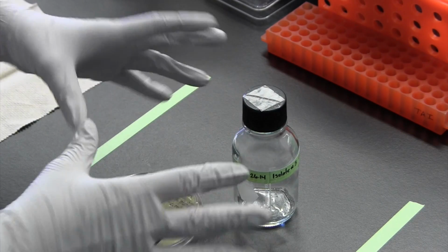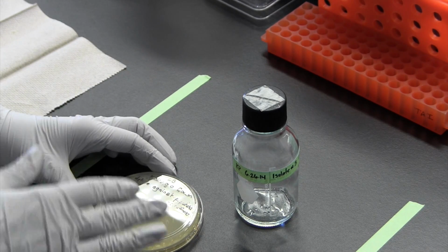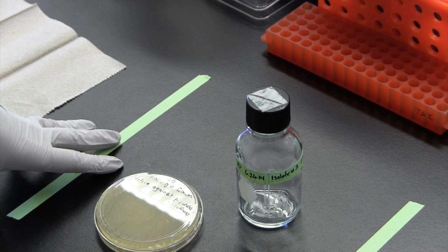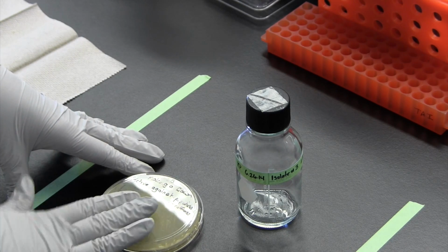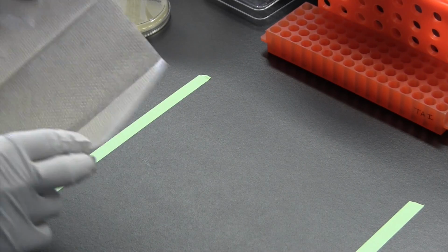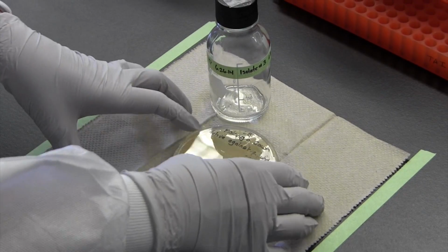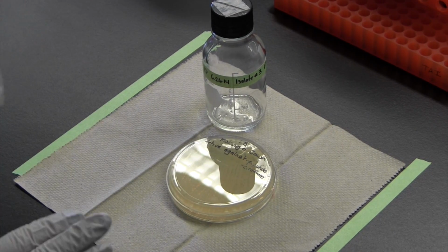Because this can be a little bit of a messy procedure, what you want to be sure to do is be really careful about your clean space. You can work directly on the bench, but be sure to understand that you may actually spill some of this material on the bench, and you're going to need to take appropriate procedures to clean that up because this is an environmental sample and it is an unknown at this point. So what a lot of people do is they'll either use a paper towel in their workspace like this, or you can use bench coat or lab mat or whatever you might have available to you. That way, if you do have any spillage, you can wrap that up and put it into your biohaz waste. Then, of course, you'd still want to spray down and wipe everything down in the environment that you're working with.